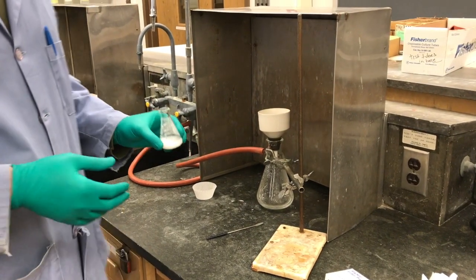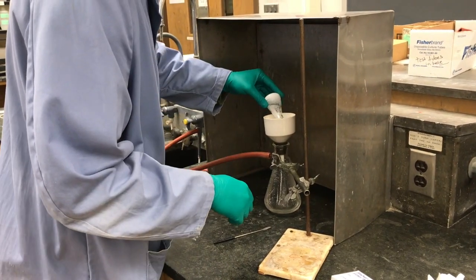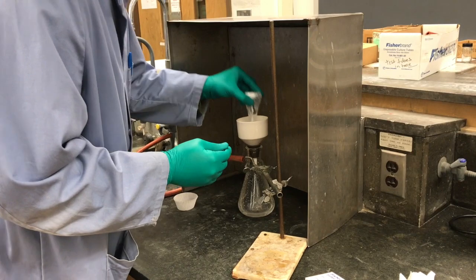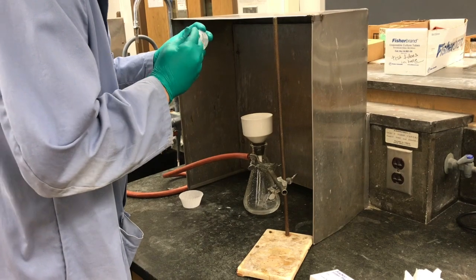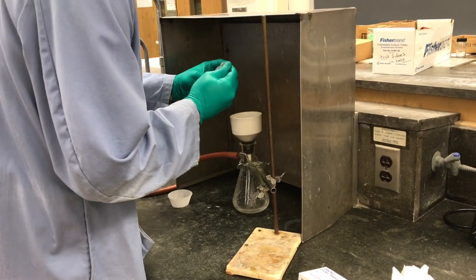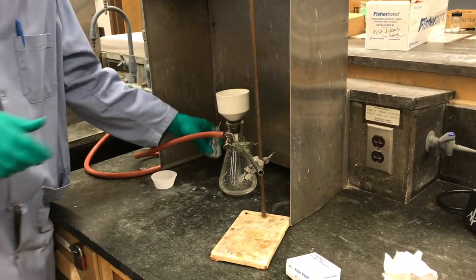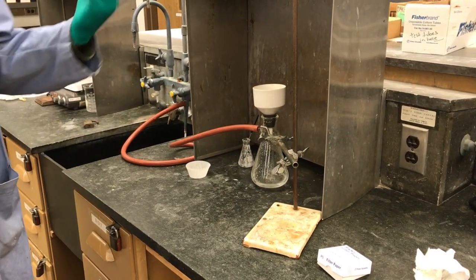I've already pre-wet this with a little DI water. Now I'm going to grab some cold DI water and rinse this to make sure that we're getting a nice clean product.